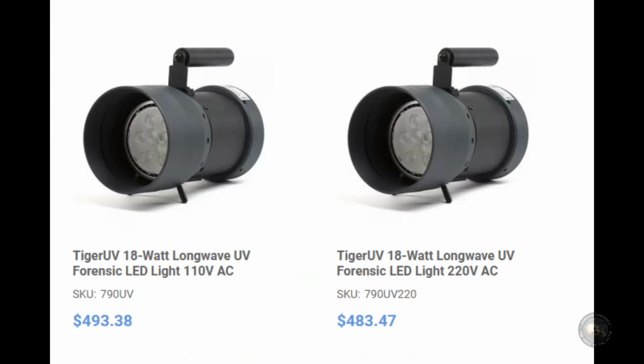So take a look at these. These are long wavelength ultraviolet systems. So the researchers talk about this, and they said that the degree of DNA damage was not significant by using these systems, but they have to be at least at 350 nanometer level. And they also have to be used from a distance.